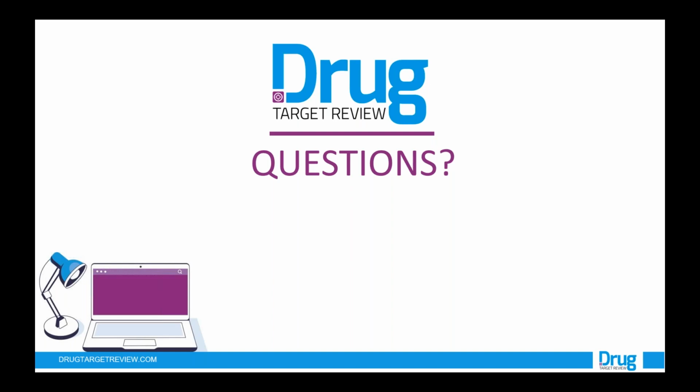Great, thank you. So I now actually have a follow-up comment from the melting temperature question earlier. If there's the same melting temperature value, why then are there different hill slopes? And a comment that a potential guess would be a compound that's targeting a different domain. And that's for Paul.